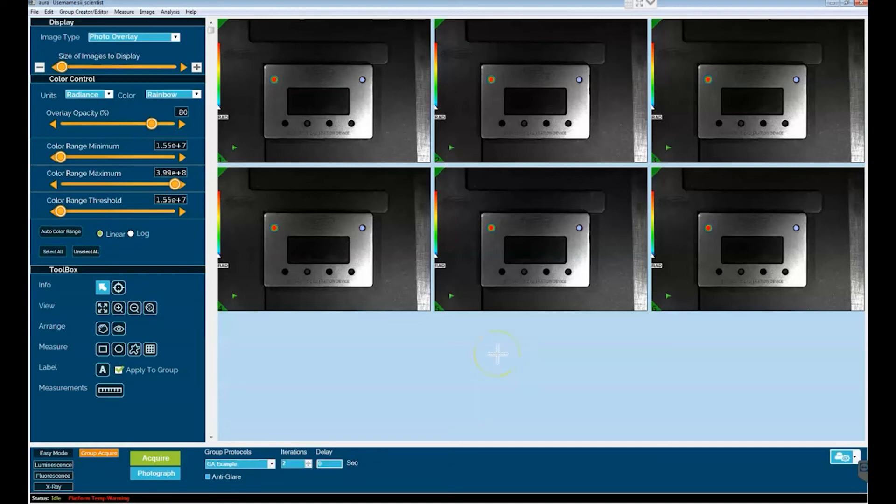All right, so this is basically how one does multiple imaging protocols in Aura through group acquire.